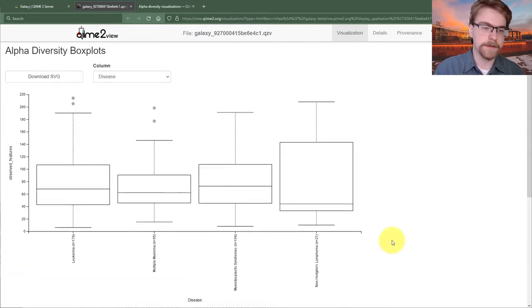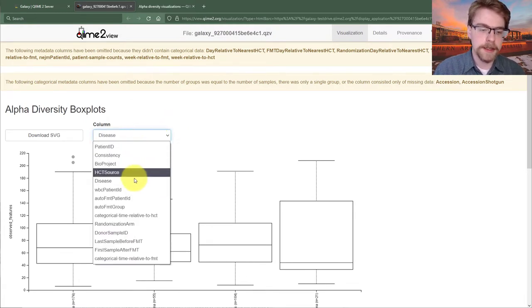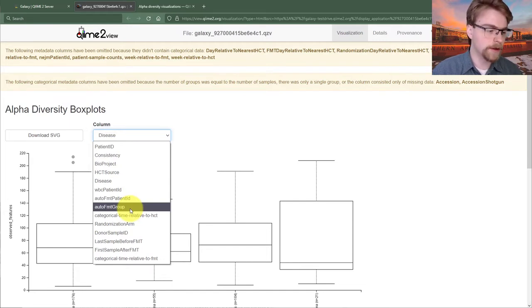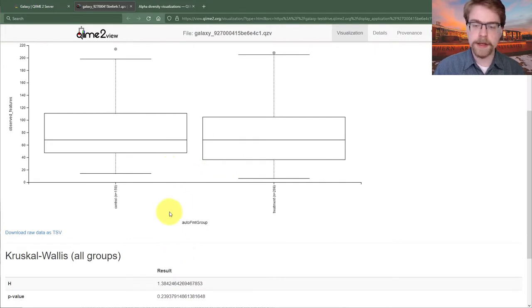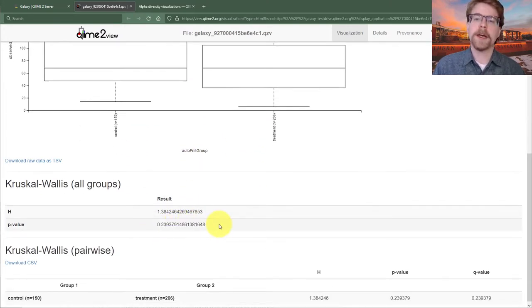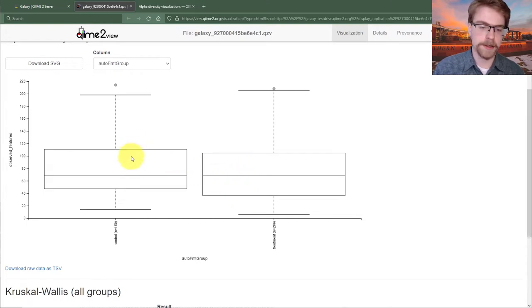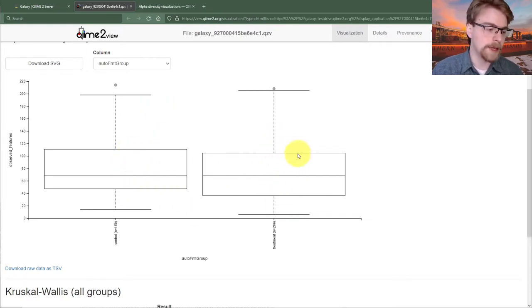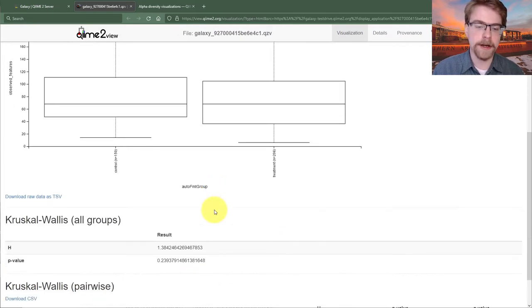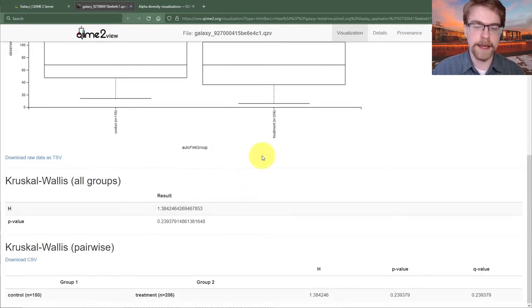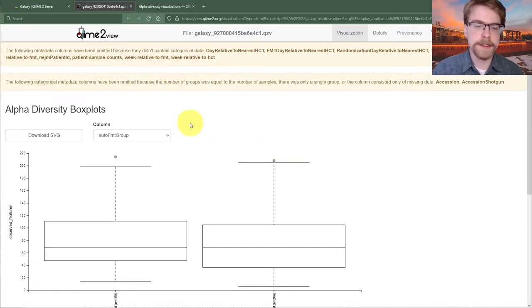Another thing we might be interested in is whether the group that received the autofecal microbiota transplant is significantly different from the control group. Looking at the auto FMT group, the original paper reports a difference, but that's not seen here because we don't have a significant result. The box plots really aren't compellingly different — the control actually skews opposite to what you'd expect. This is largely because we are not controlling for individuals, so we need a more sophisticated approach.